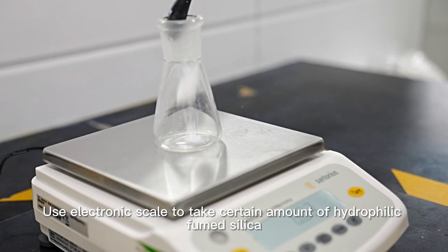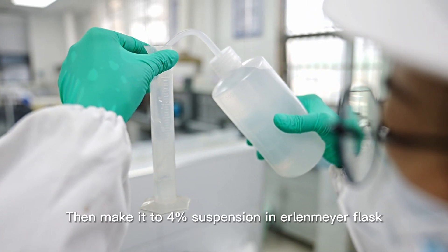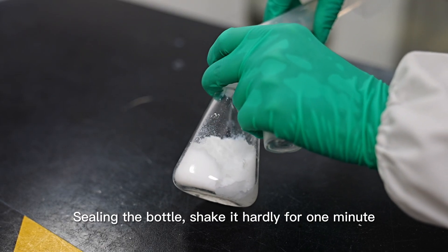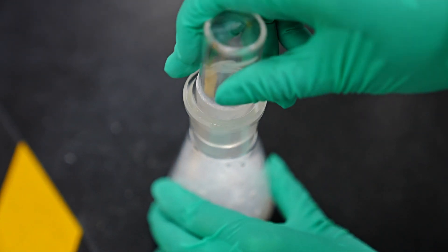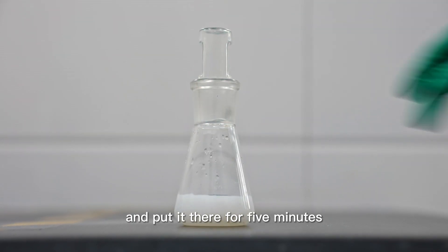Use an electronic scale to take a certain amount of hydrophilic fumed silica, then make it into a 4% suspension in an Erlenmeyer flask. Seal the bottle and shake it heartily for 1 minute, then let it stand for 5 minutes.